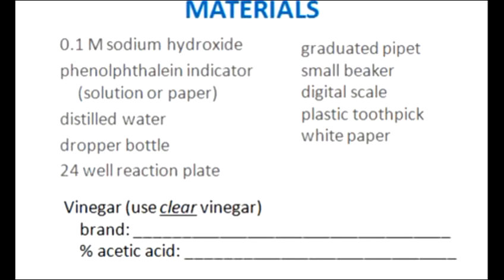I need you to tell me what brand of vinegar you're using, and I need you to write in the percent acid from the label on this line. Now let's go down to my kitchen and perform this lab.